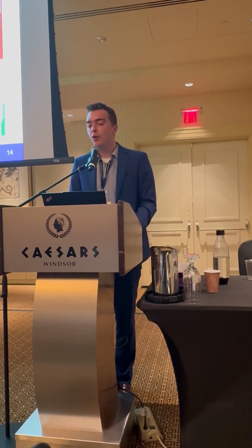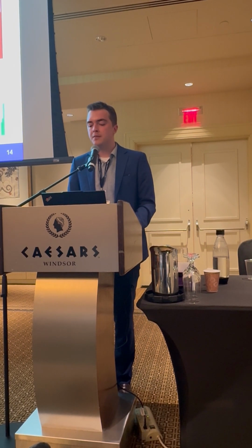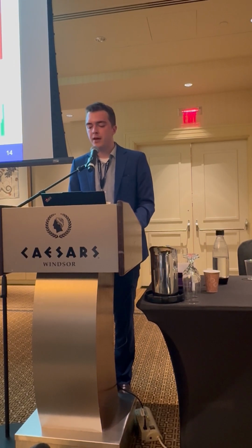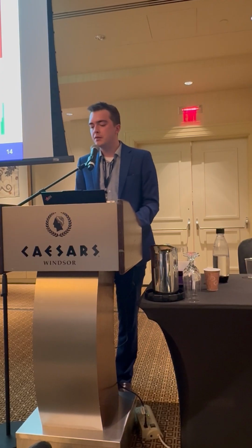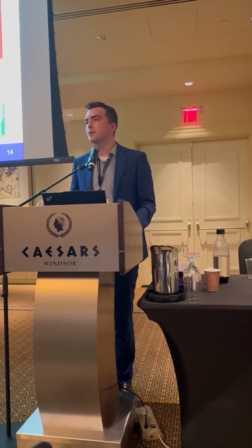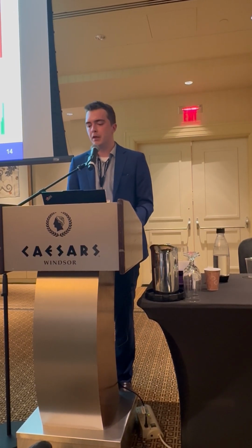Next, by looking at those cohort-specific mutations, so again, those found across all 4 mice of a given cohort but not found in any of the other, I observed a 15.2-fold higher number of mutations shared across the knockout mice that are not seen in the wild type, with a very small p-value less than 0.001. These results are really consistent with those prior genotyping array data, where the same phenomenon was observed for those knockout lung metastases, with that higher amount of shared SNVs between samples intra-mouse, which was quite unique considering that they're independent biological replicates and their tumors undergo individual tumor evolution.